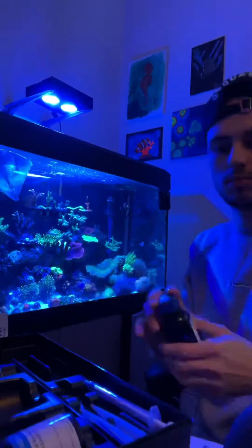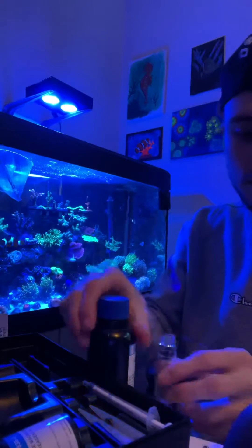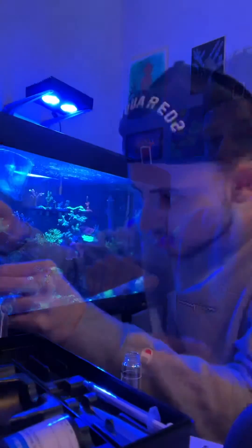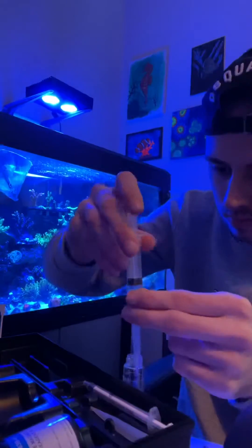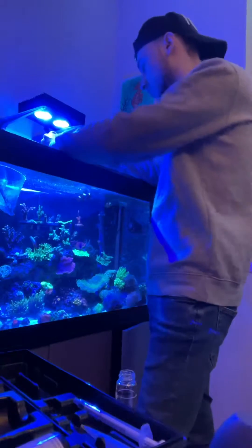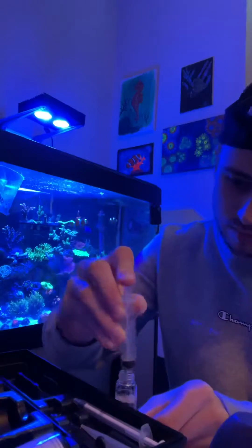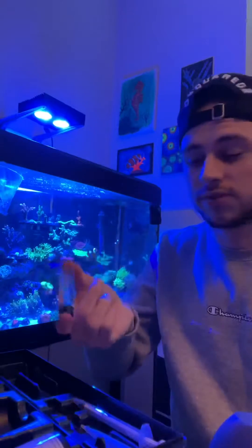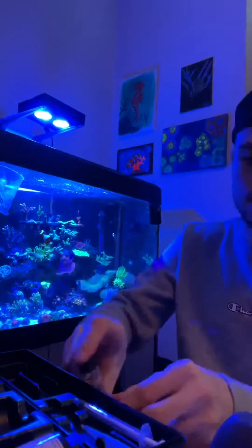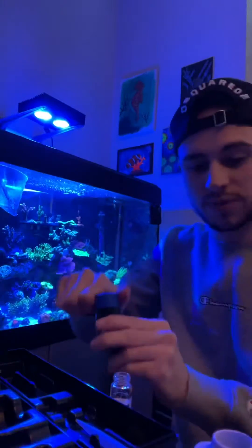So turn it on. To start the test, you need four mils of Reagent A. So that one's five mil of sample water. And now you invert it five times. So now you zero out the Hanna checker. And then you add one mil of Reagent B.